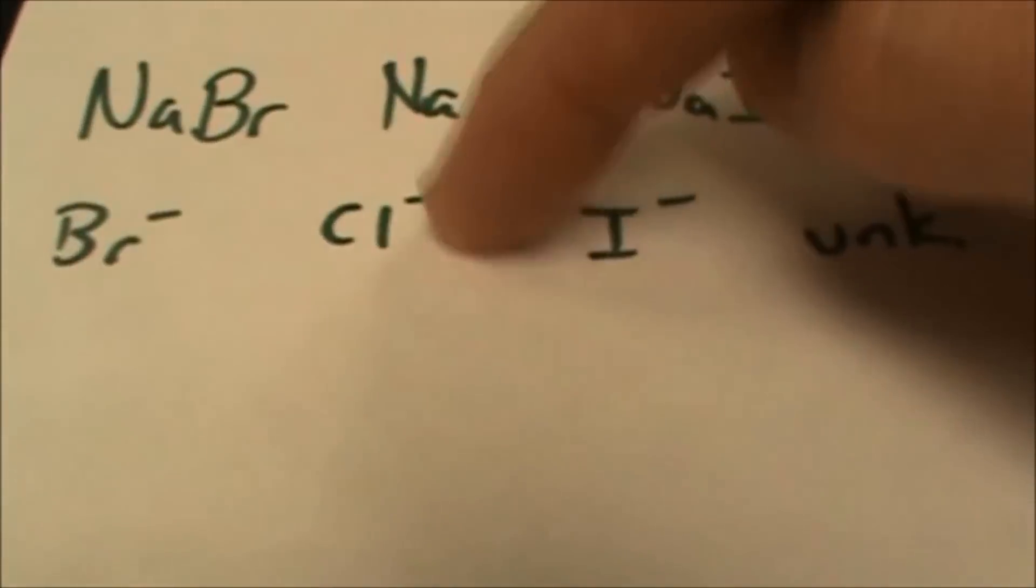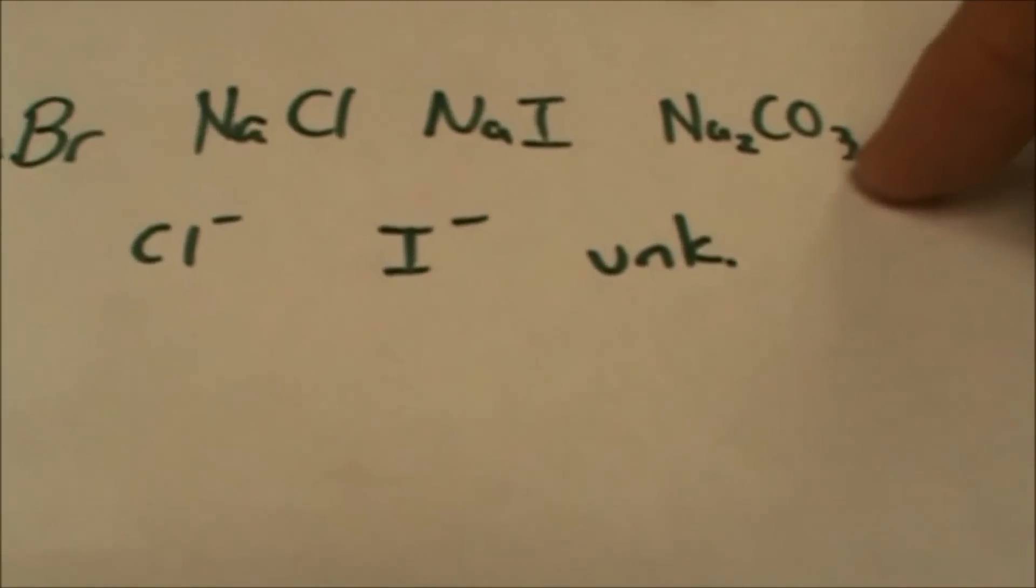I've put a bromide, a chloride, an iodide, and my unknown. In this case my unknown is going to be sodium carbonate.